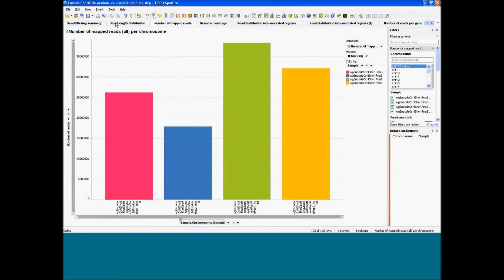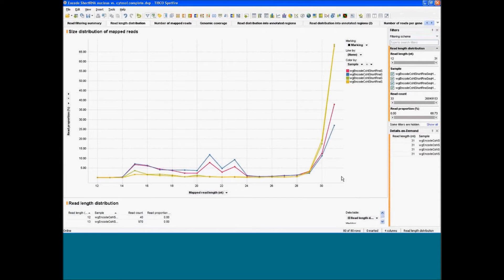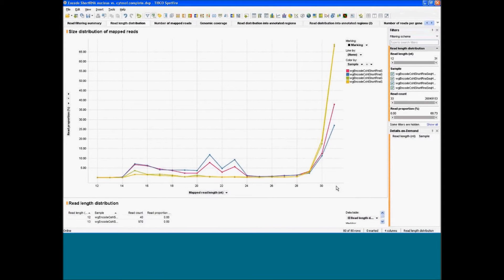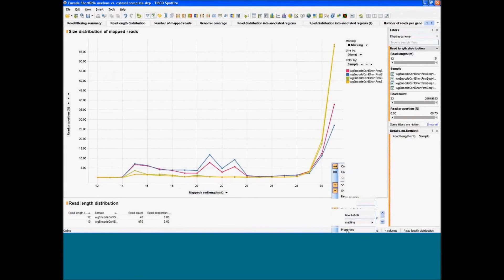For instance, the size distribution of the reads — this is very basic. Usually you expect most reads to have the same size, especially with Illumina sequencing with a fixed number of cycles. However, it can depend on the specific protocol. In this case we are sequencing short RNAs, so the size will depend on the adapter removal and so on. You can check this out and modify parameters.